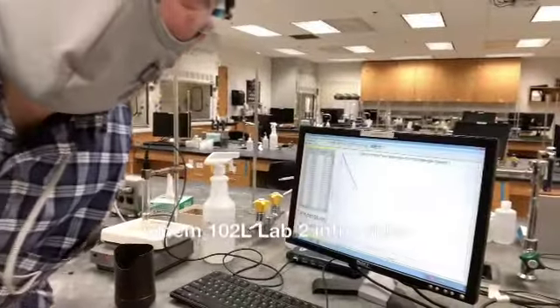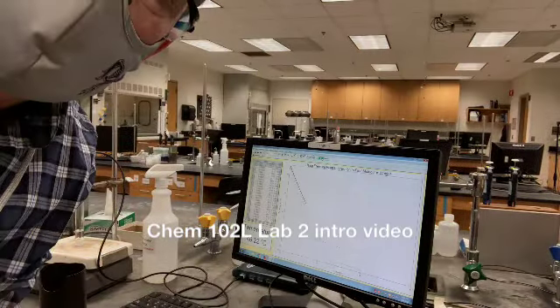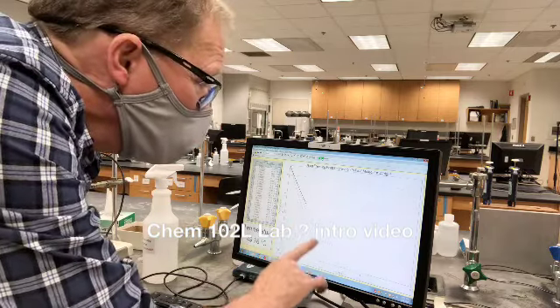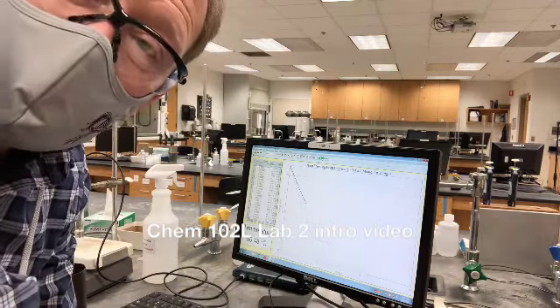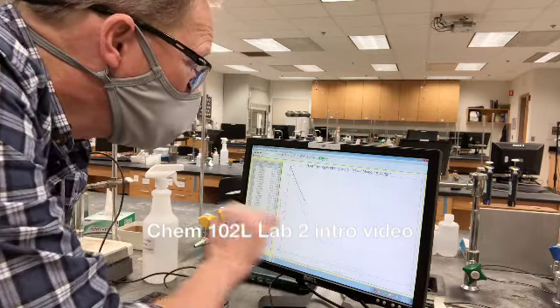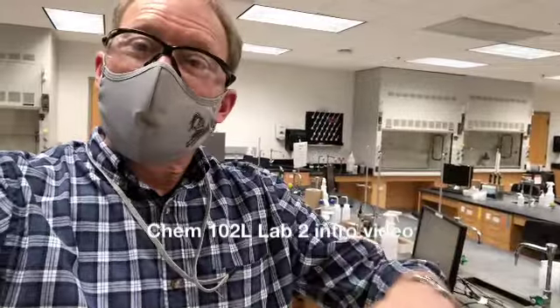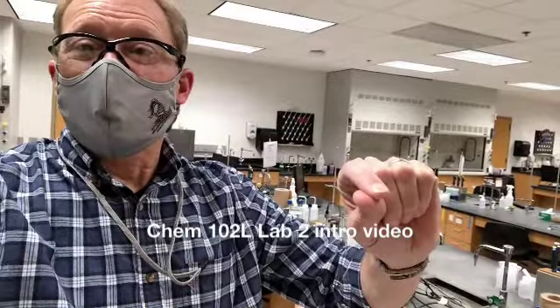And when you open up your Logger Pro, you'll see there are two curves here, and one's lower than the other because that's the freezing point depression. So you'll find freezing points from these two, and that change in temperature will be what will give you that freezing point depression. You'll see how much that freezing point gets lowered by the amount that you precisely measured of mass of the solute, and you'll be able to calculate a molality that will allow you to calculate a molar mass, and that'll be a clue to help you identify that unknown compound.